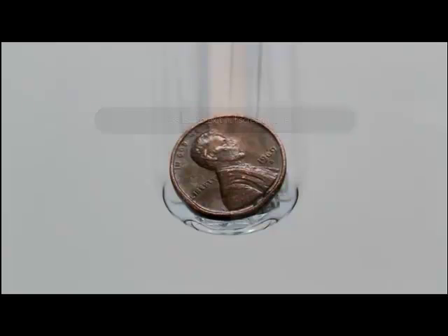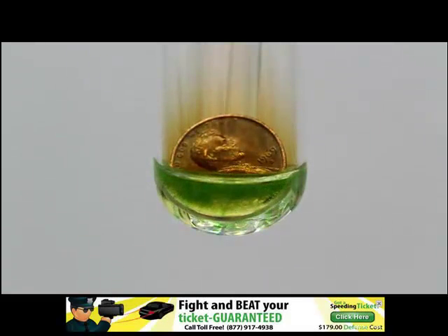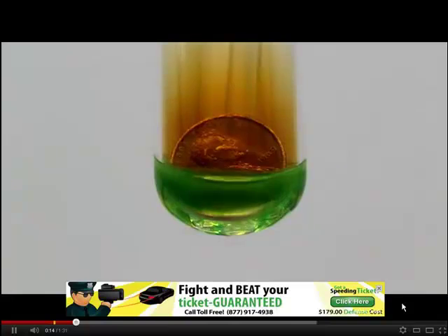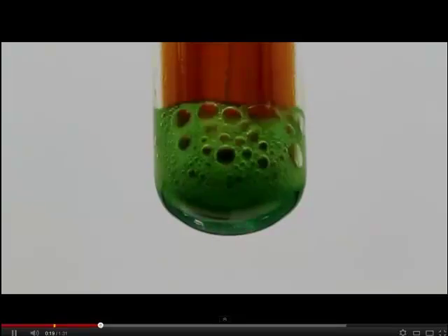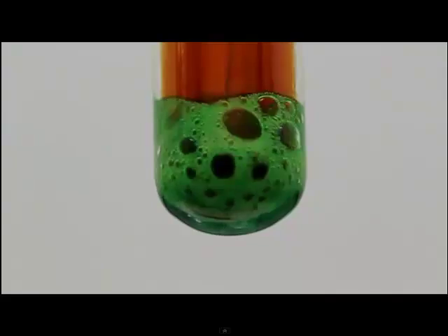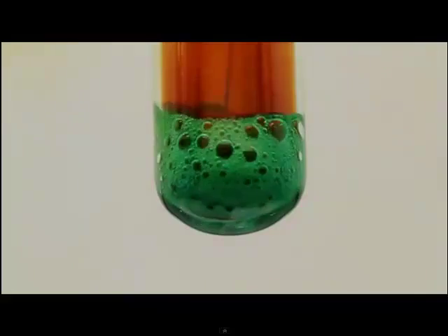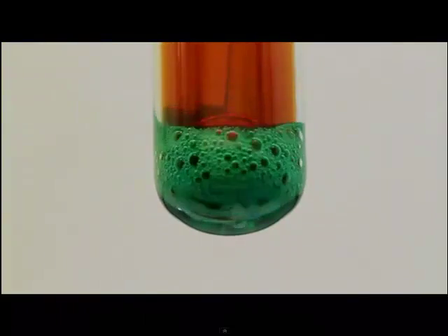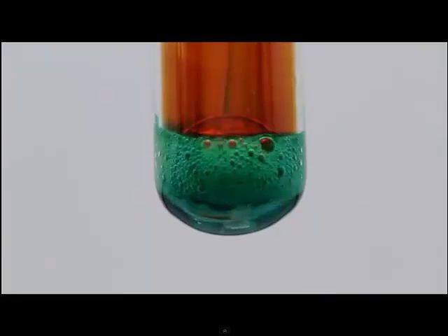This here is a 1969 copper penny, and concentrated nitric acid is being added to the penny. As it is added, you see a brown gas being produced, and the solution is a bluish greenish color.